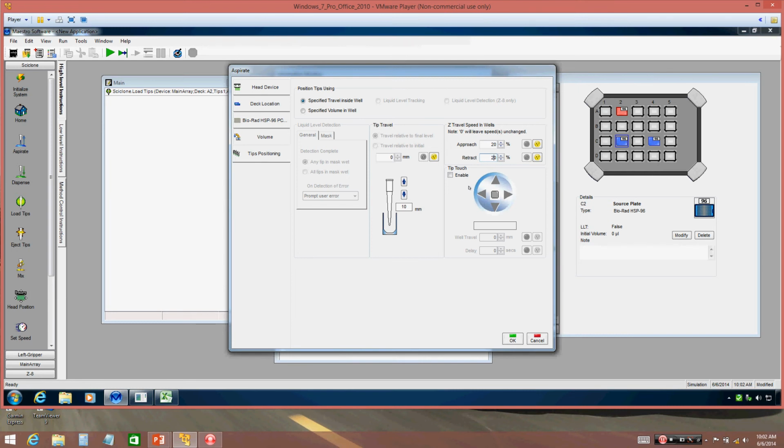Library prep or even capture steps are several hour processes. So you want to go at 100% across the deck if you can. However, when you're doing your fine liquid handling, you don't want it to go into your liquid at 100% and come out at 100%.